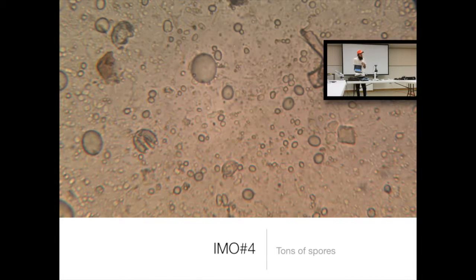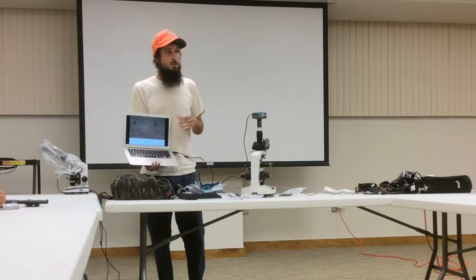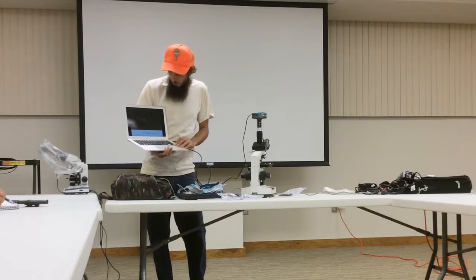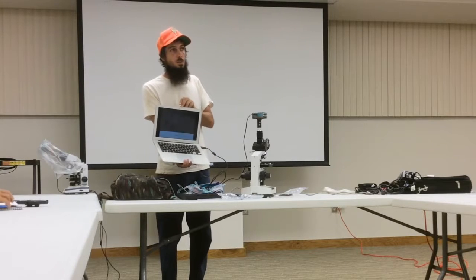And this is just what IMO 4 looks like. When you put IMO 4 in, the sugar and the osmotic pressure make things form globs and spores, and there's not much active stuff happening in the actual input. So if you just take the inputs and look at them, they're not that exciting. But once you dilute them and get them wet and the sugar is not so powerful, this will sprout into life. But every once in a while you will find some fungus living in IMO itself.